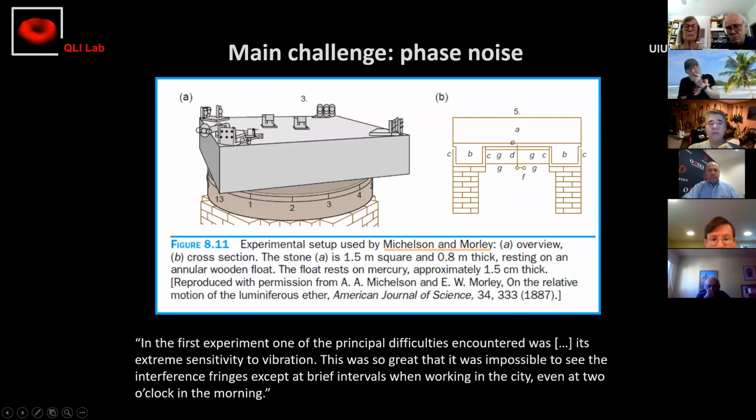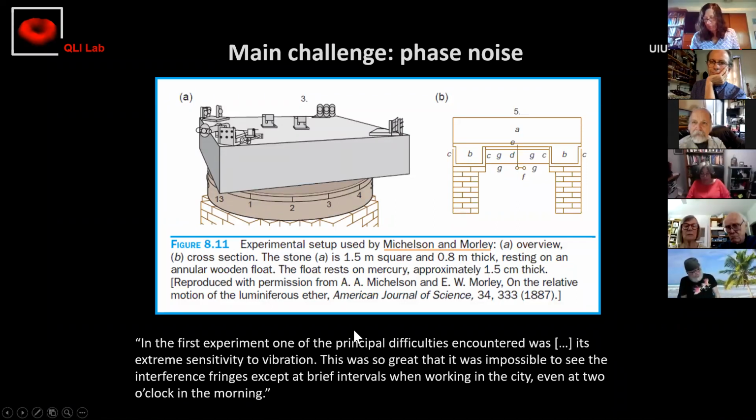to basically unmeasurable levels. In other words, it takes very little to create a noise level of the order of the wavelength of light. So for visible light, imagine that's half a micron of delay. So if you breathe on top of your experiment, if there is a vibration in the mirrors or lenses and so on, that information is gone.